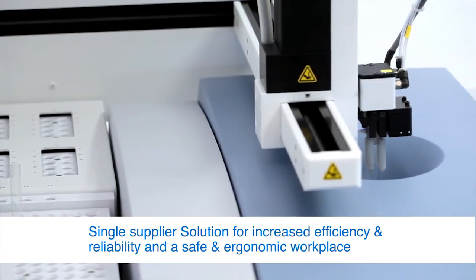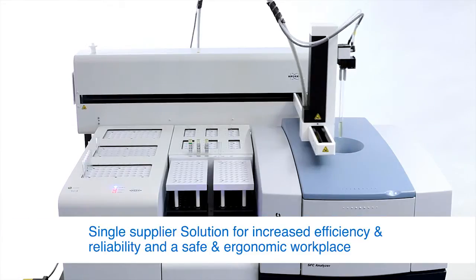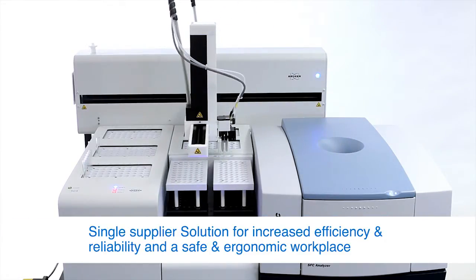Using the Bruker automation, minispec and software guarantees a worry-free solution for your analytical problem. For more information or support, find us at Bruker.com.